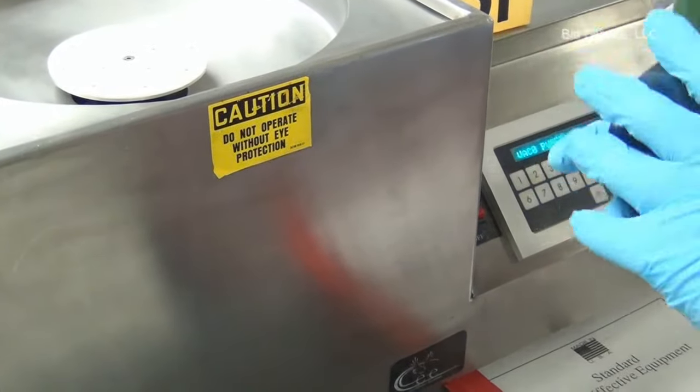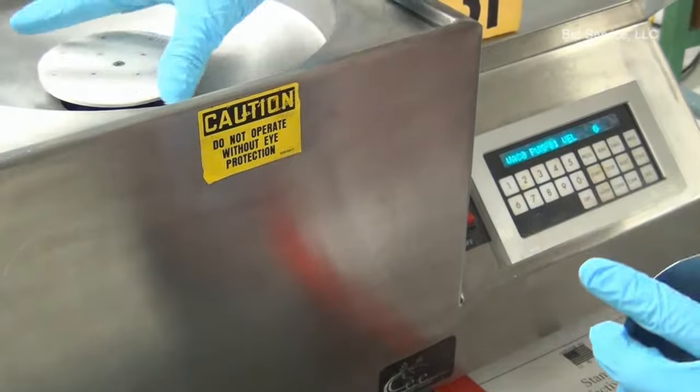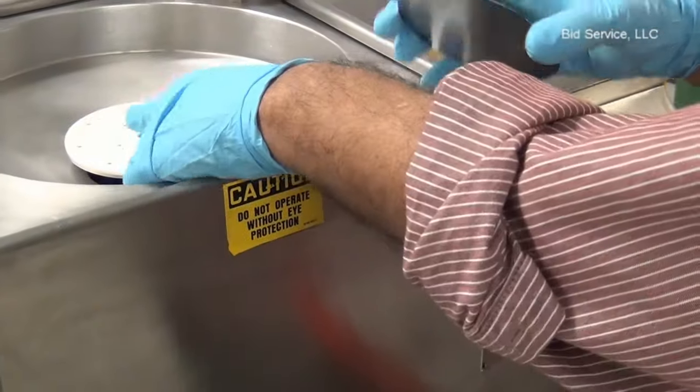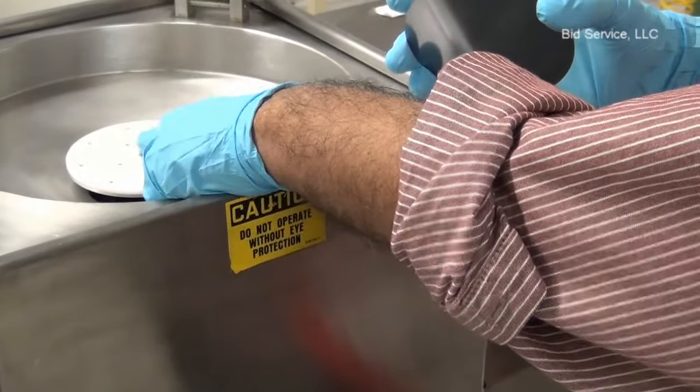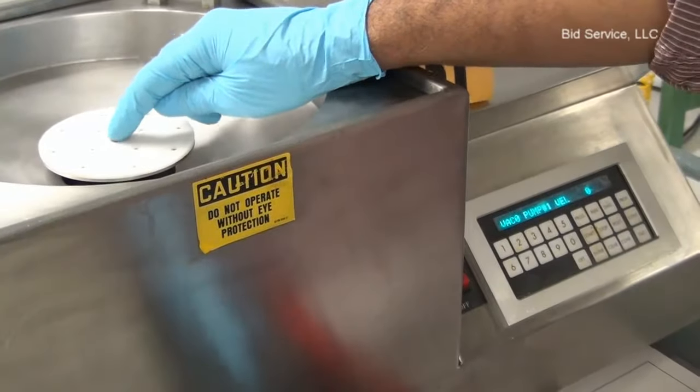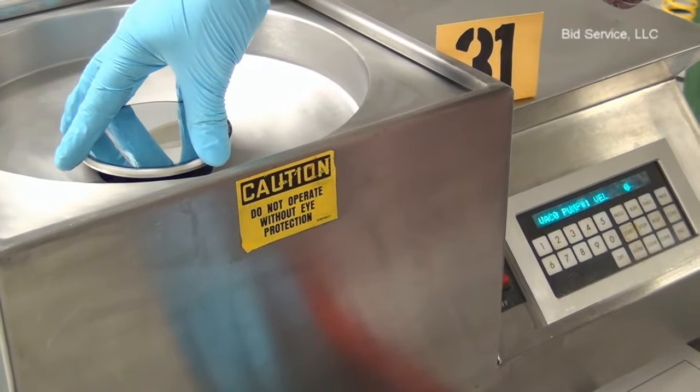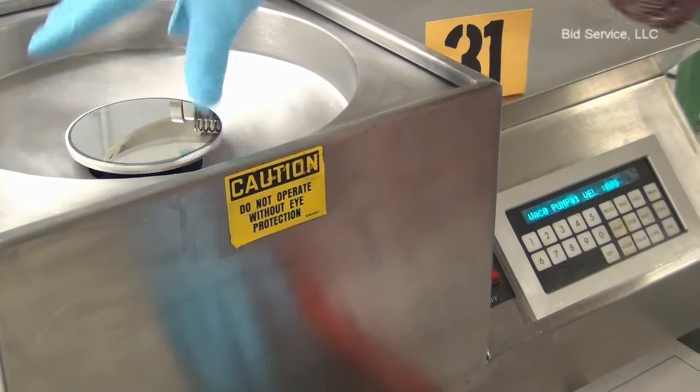The wafer bottom side should be clean and the chuck top surface also should be clean, because the vacuum is from the perforation to the screw. Care should be taken that the chuck top is always clean.